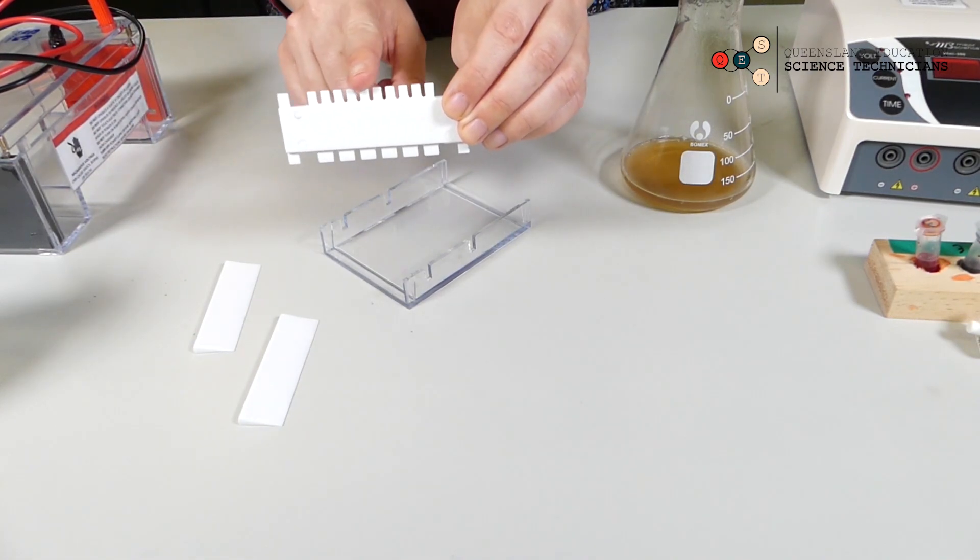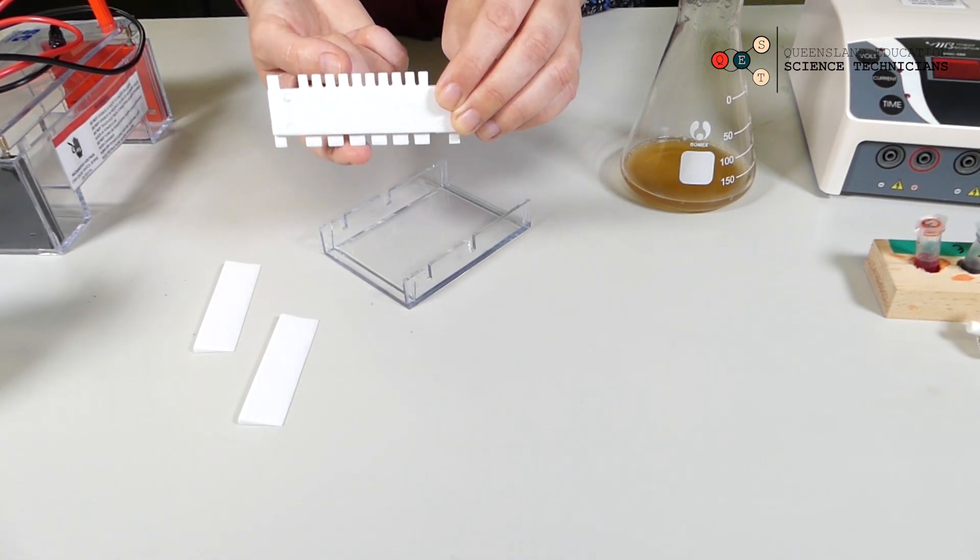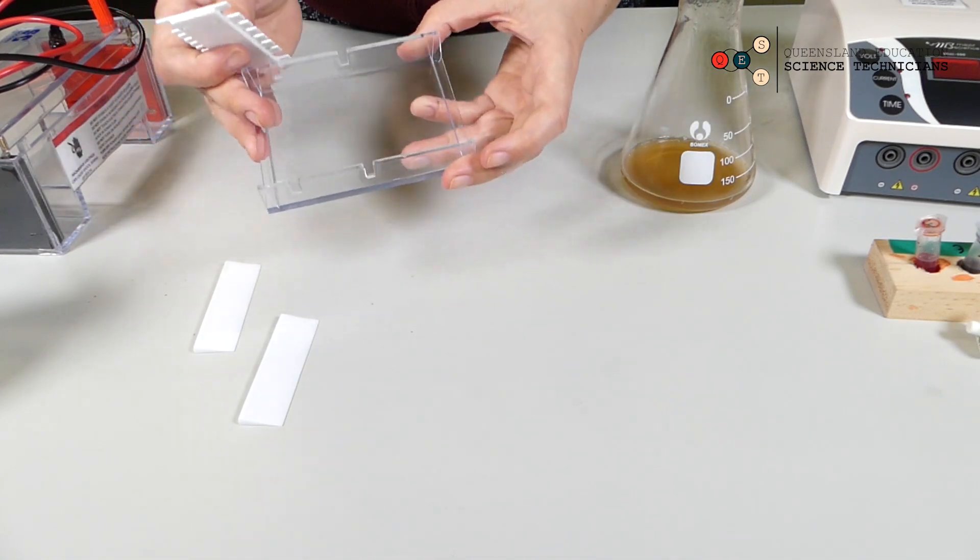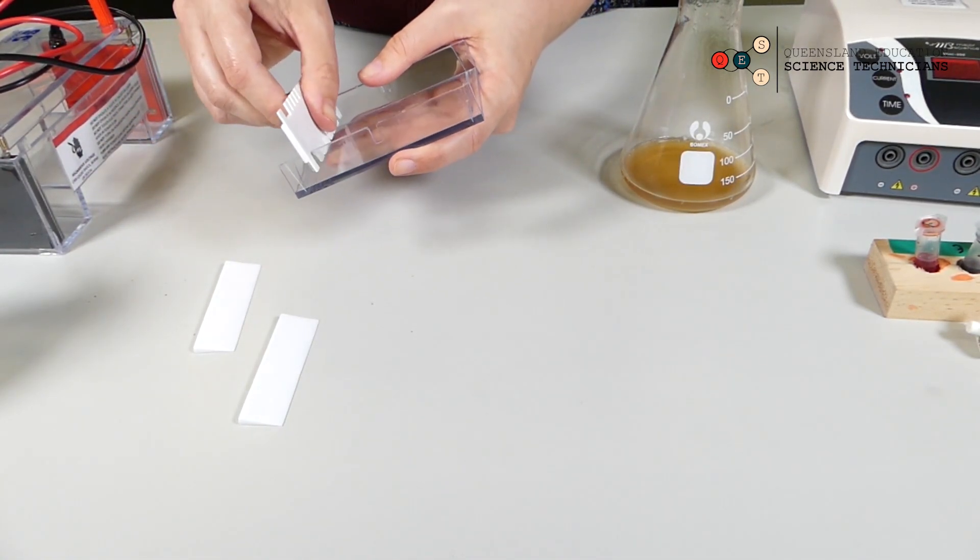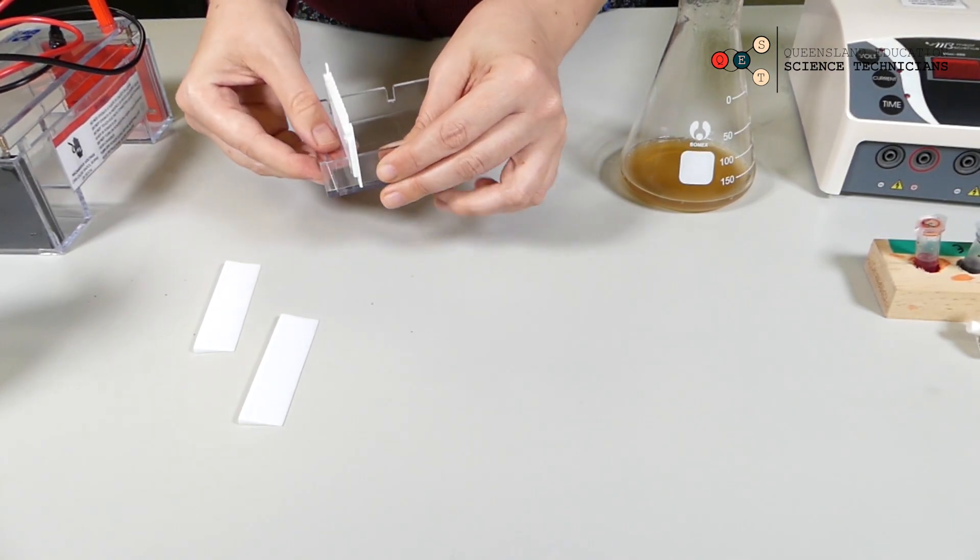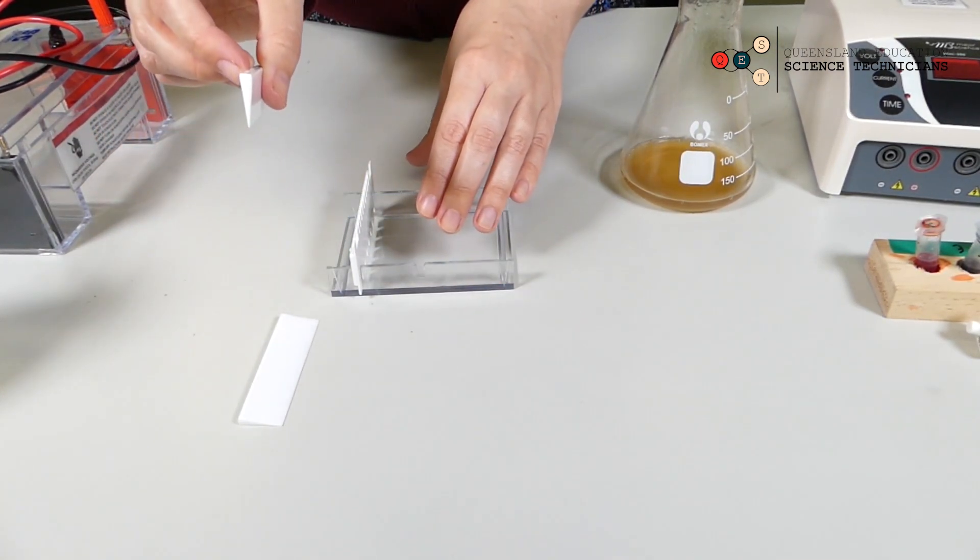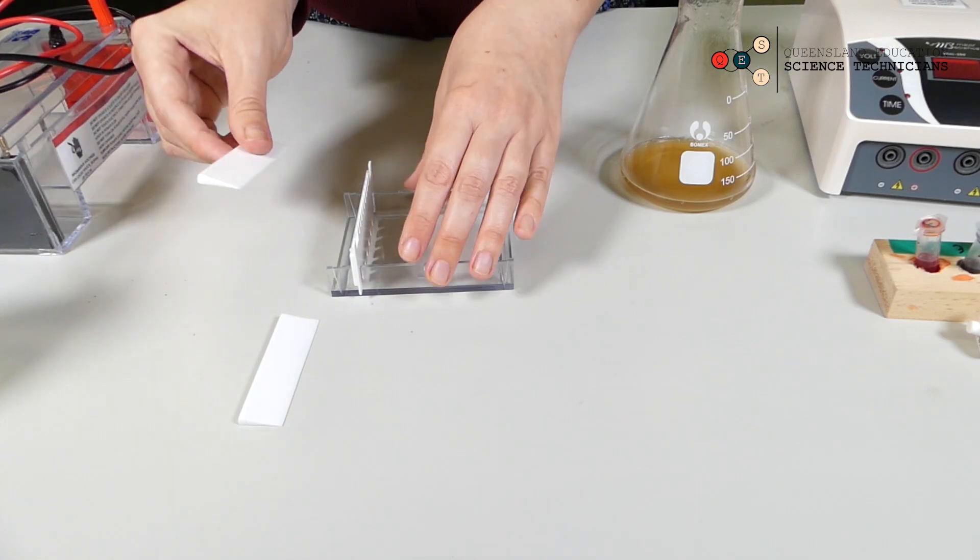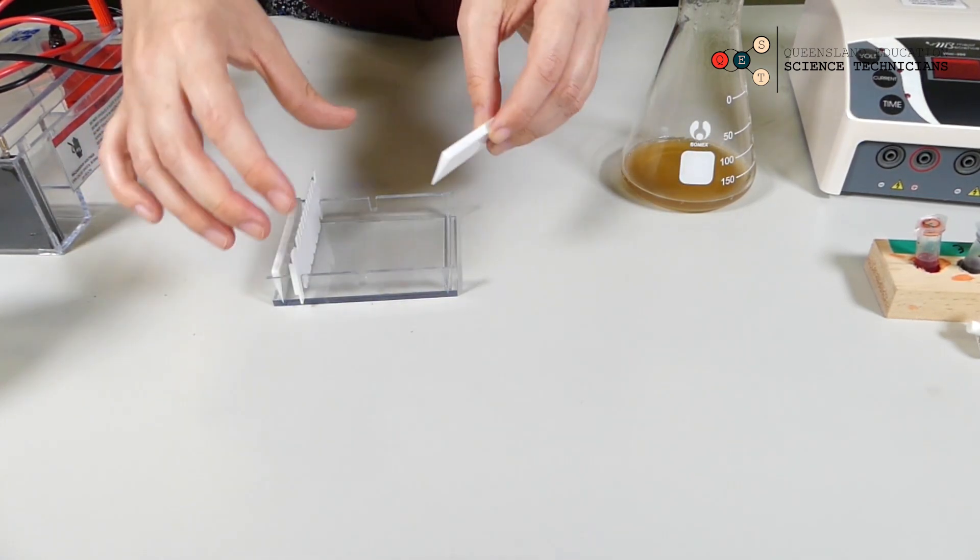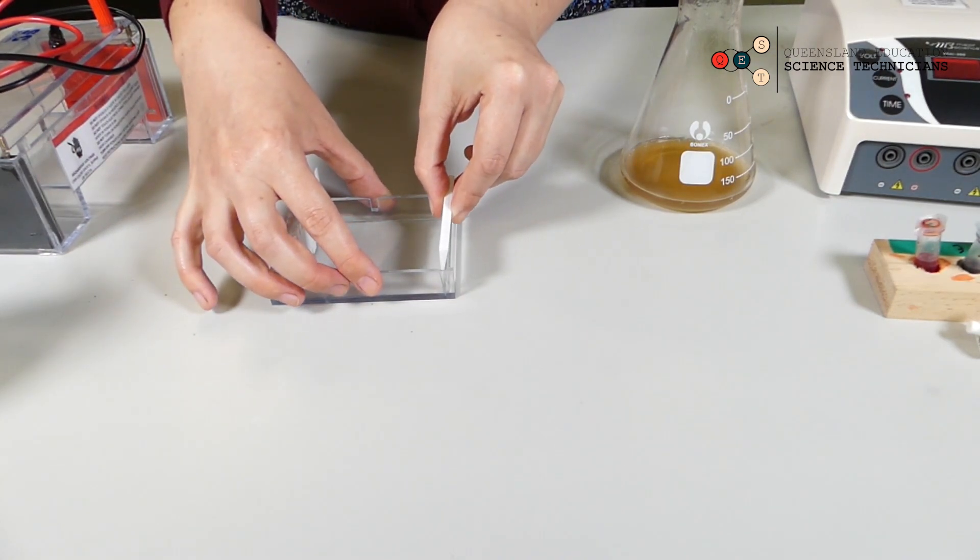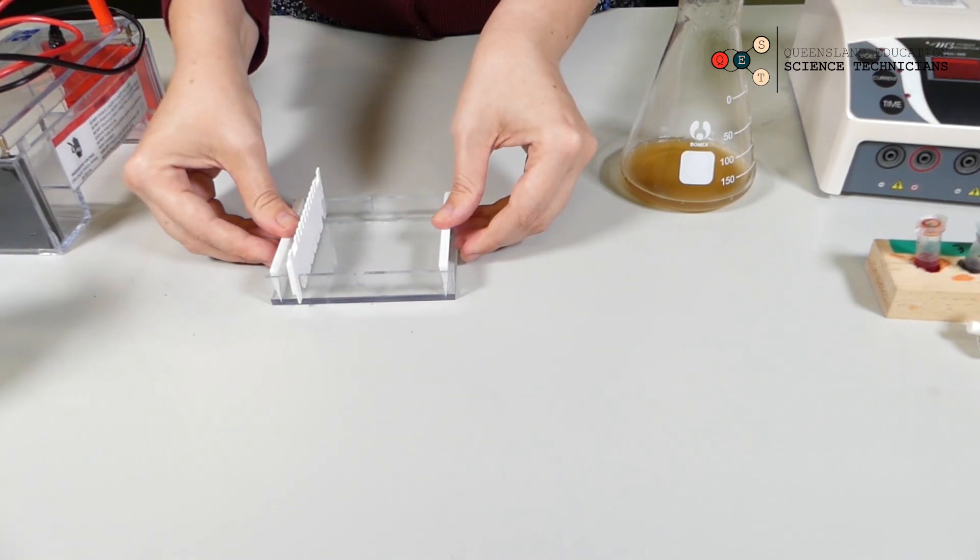We've got two options: small teeth and big teeth. We're going to use the big teeth. So we're going to put these at one end of our gel mold and then use these triangle gates to make the other end of the mold. This is so that the molten agar doesn't just run out all over the bench.